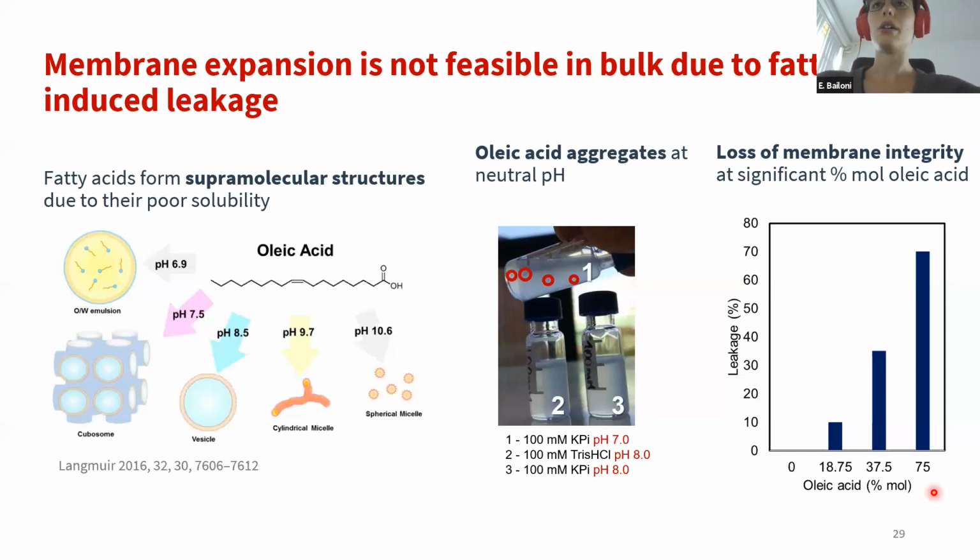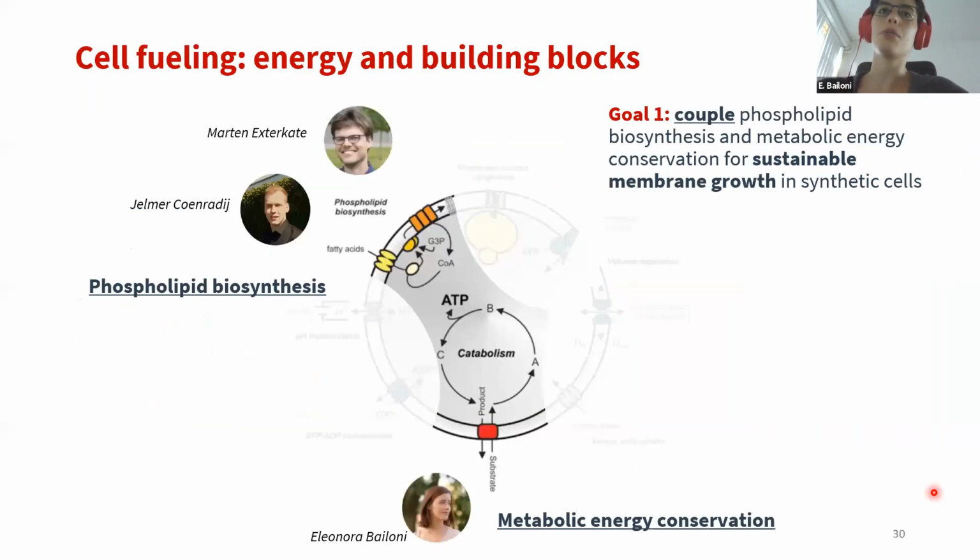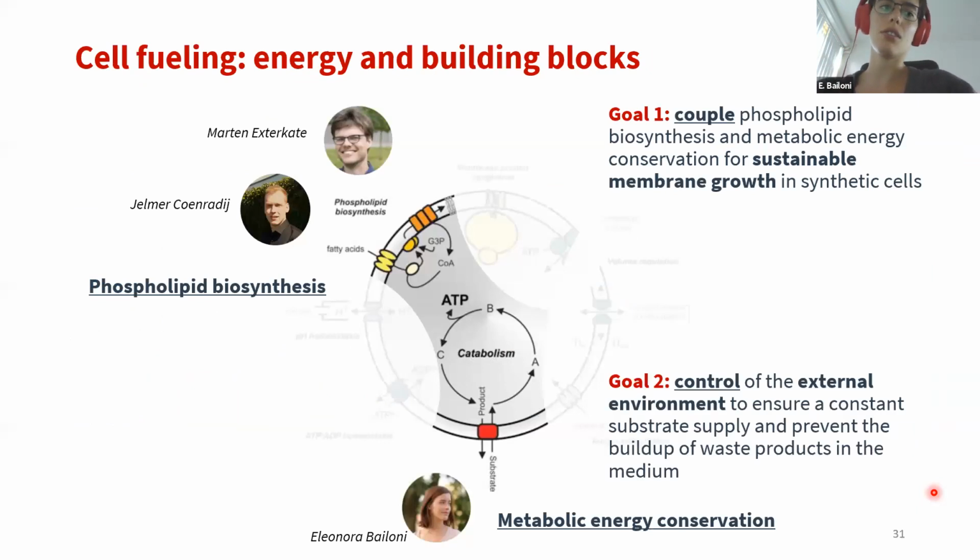we couldn't perform phospholipid biosynthesis in bulk, but rather we had to develop a technique that would allow us to feed diluted oleic acid over a prolonged period of time. And that brings me to my second goal in our shared project, which was to develop a system to control the external environment of the synthetic cells in order to ensure a constant substrate supply and also to prevent the buildup of waste products in the external medium of the synthetic cells.